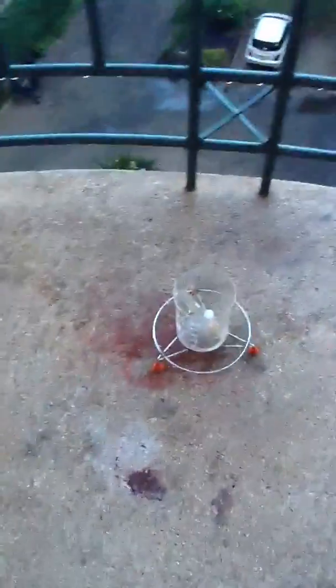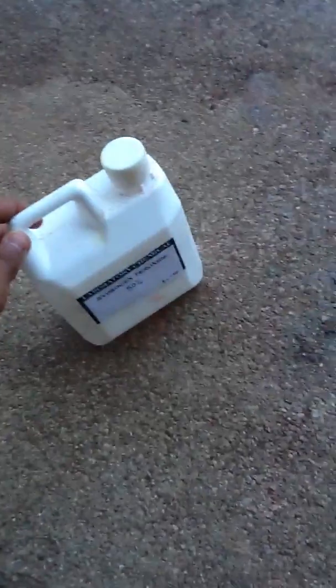Hi, today we're going to do Sodium Hydroxide and Sodium Iodide plus Hydrogen Peroxide — fifty percent. So first, we'll just add it and watch the reaction.